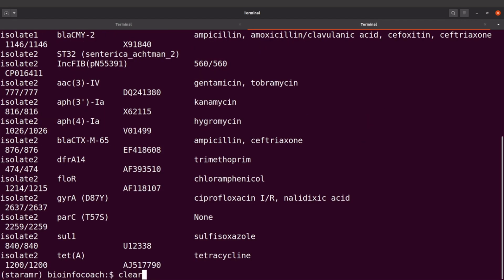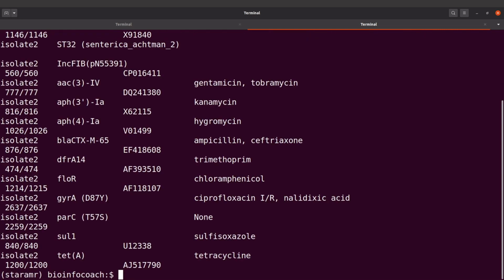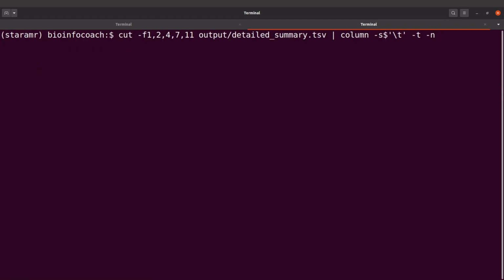Now let's rerun this command, and this time let's add -n to see what comes up. We also have a similar result here. So we have this, but you can subset. Let's clear the screen first. You can subset everything here and then just display some of them.